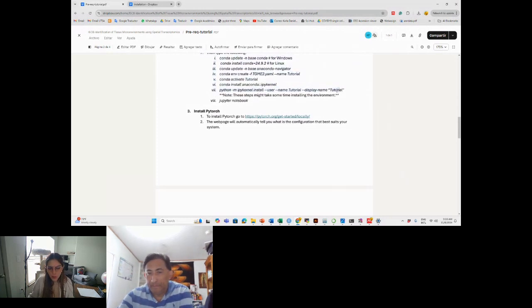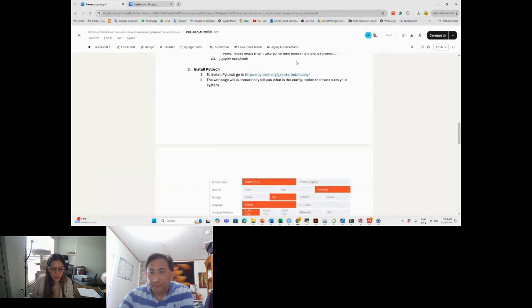And here you can give it the name that you want. Remember, if you just put tutorial here, then just put tutorial. If you put a different name, this name has to match. And in here, you can put whatever you want. After that, you will type Jupyter Notebook, and then Jupyter Notebook will open, and that's where we are going to start working.